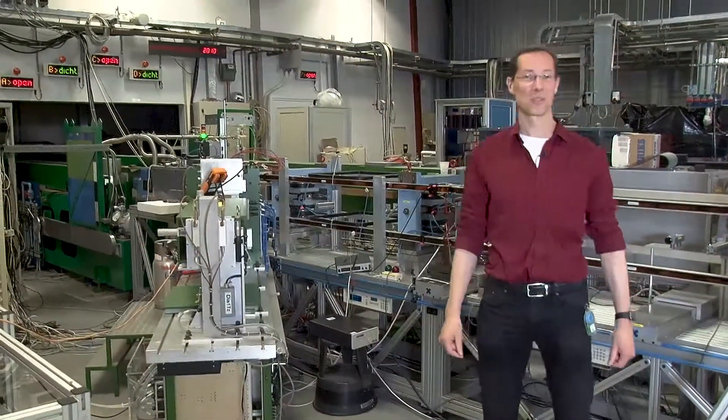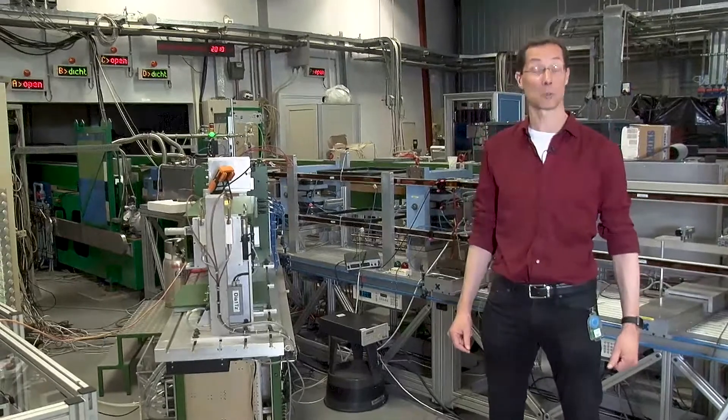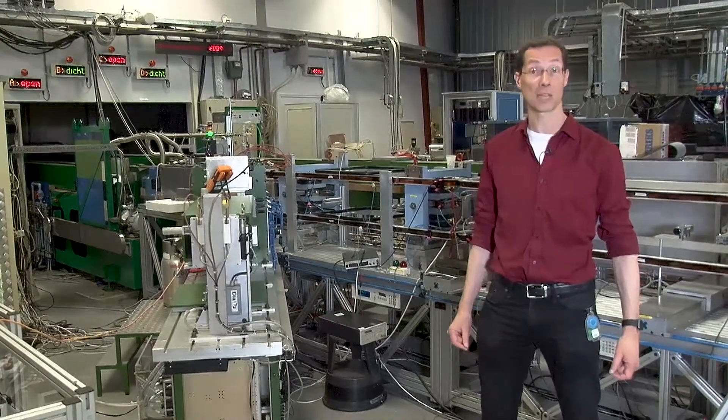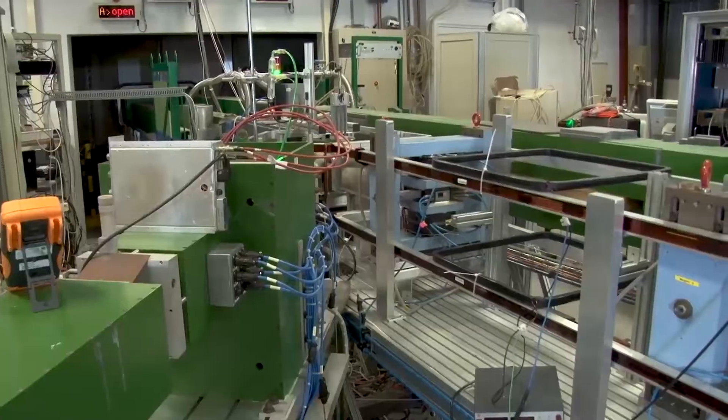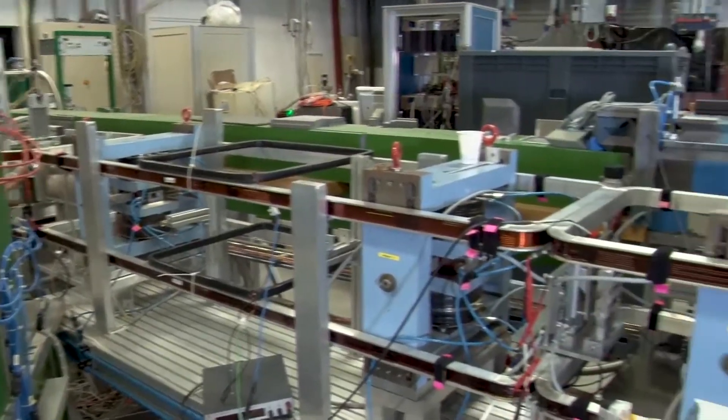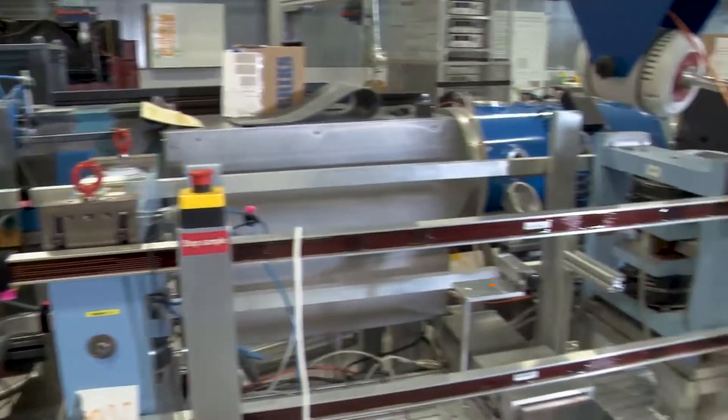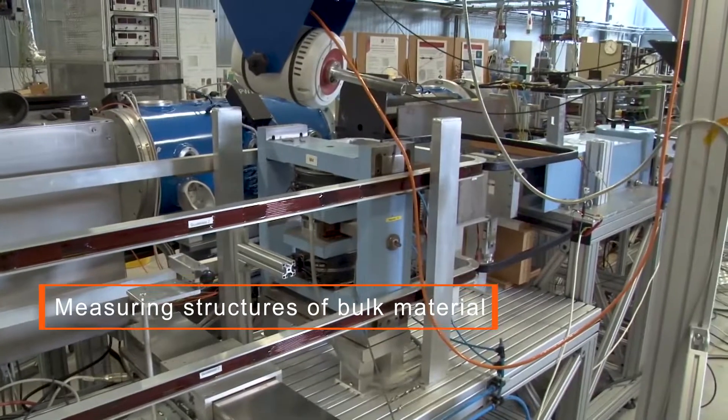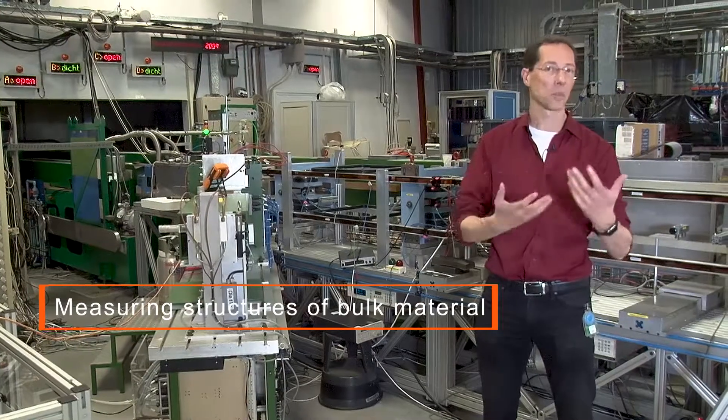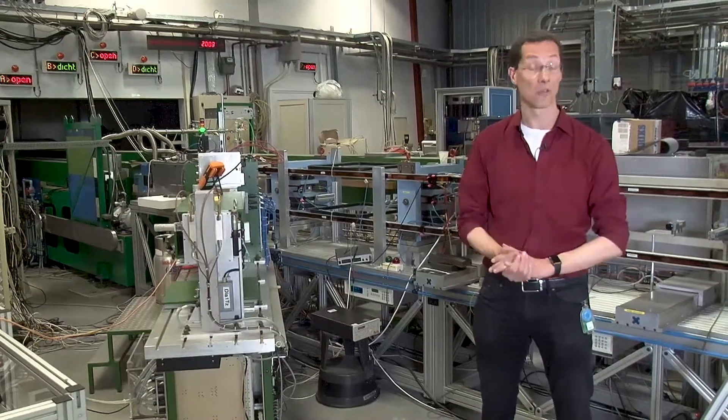We are standing here in front of the SESANS, the Spin-Echo Small Angle Neutron Scattering Instrument. With this instrument we can measure the structure of the bulk of materials on the length scales of something like a micrometer, the thousands of a millimeter.